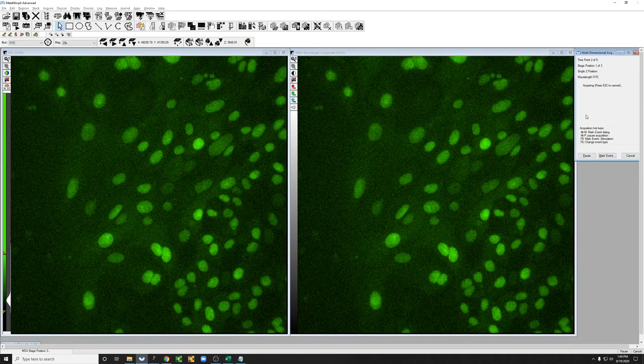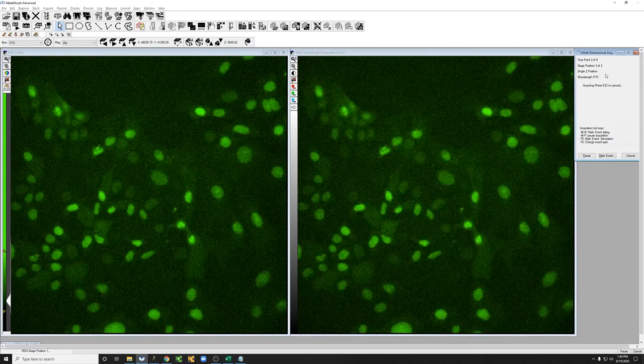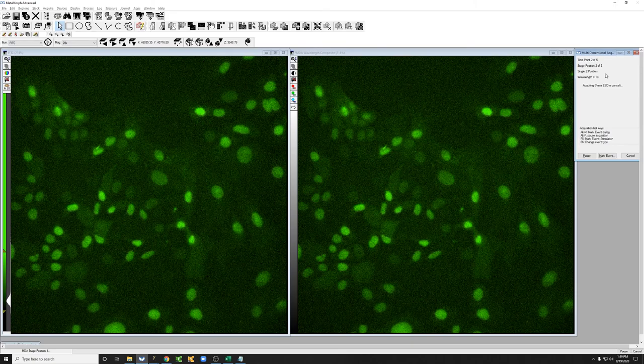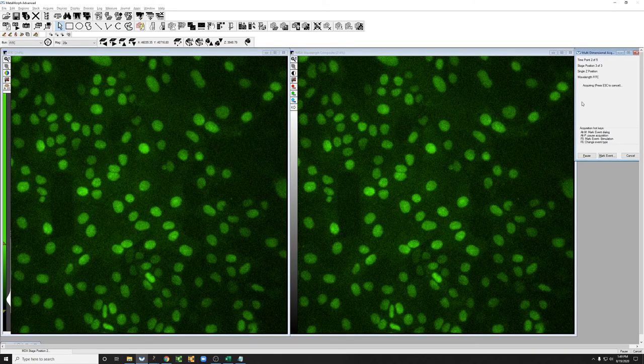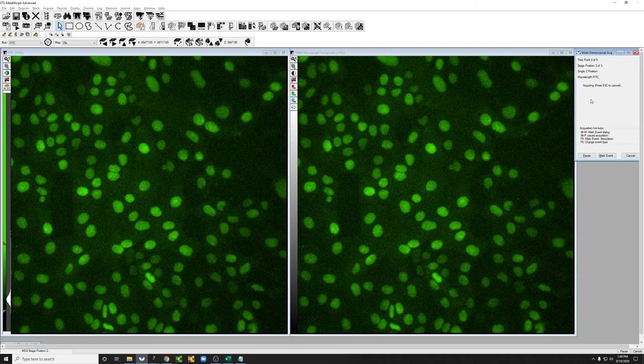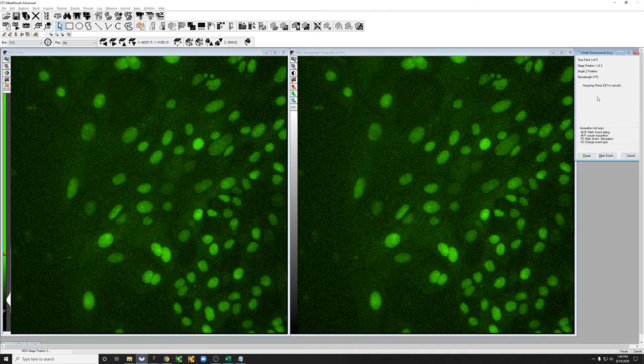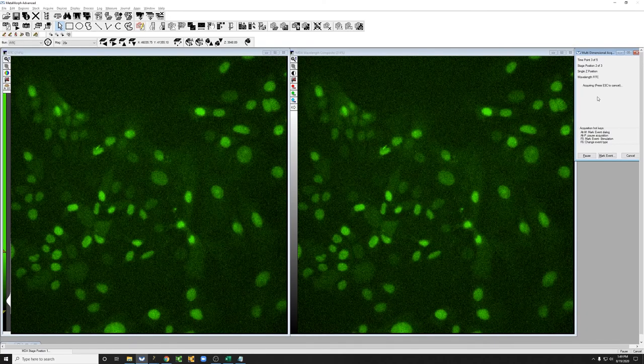And now it's going to time point two. Because that took less than five seconds, which is the interval that I put in, it's just going as fast as it can. If we had put in a longer interval, you would see something that would say waiting or time left before next acquisition here. So I will restart the video when this acquisition concludes.